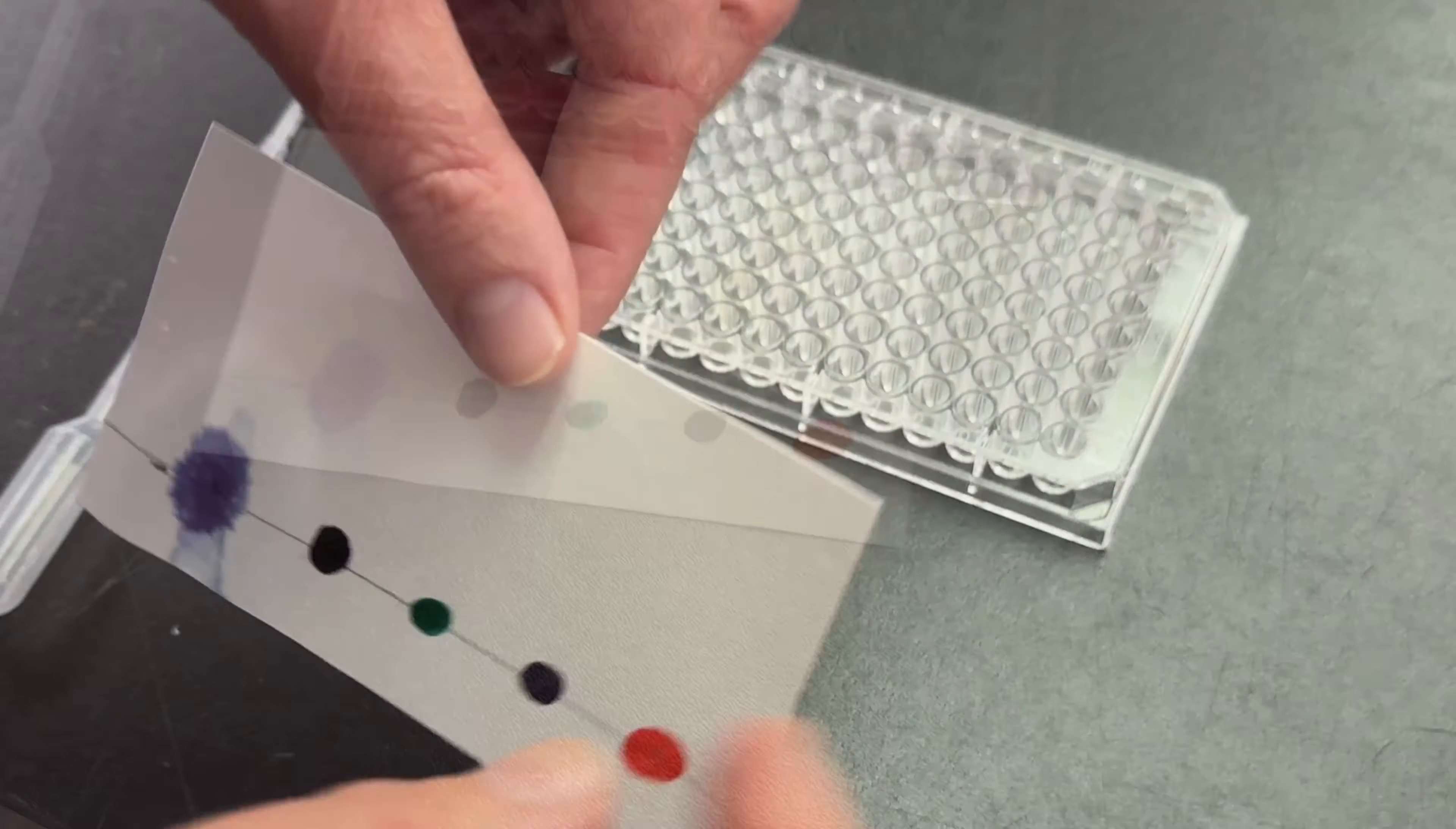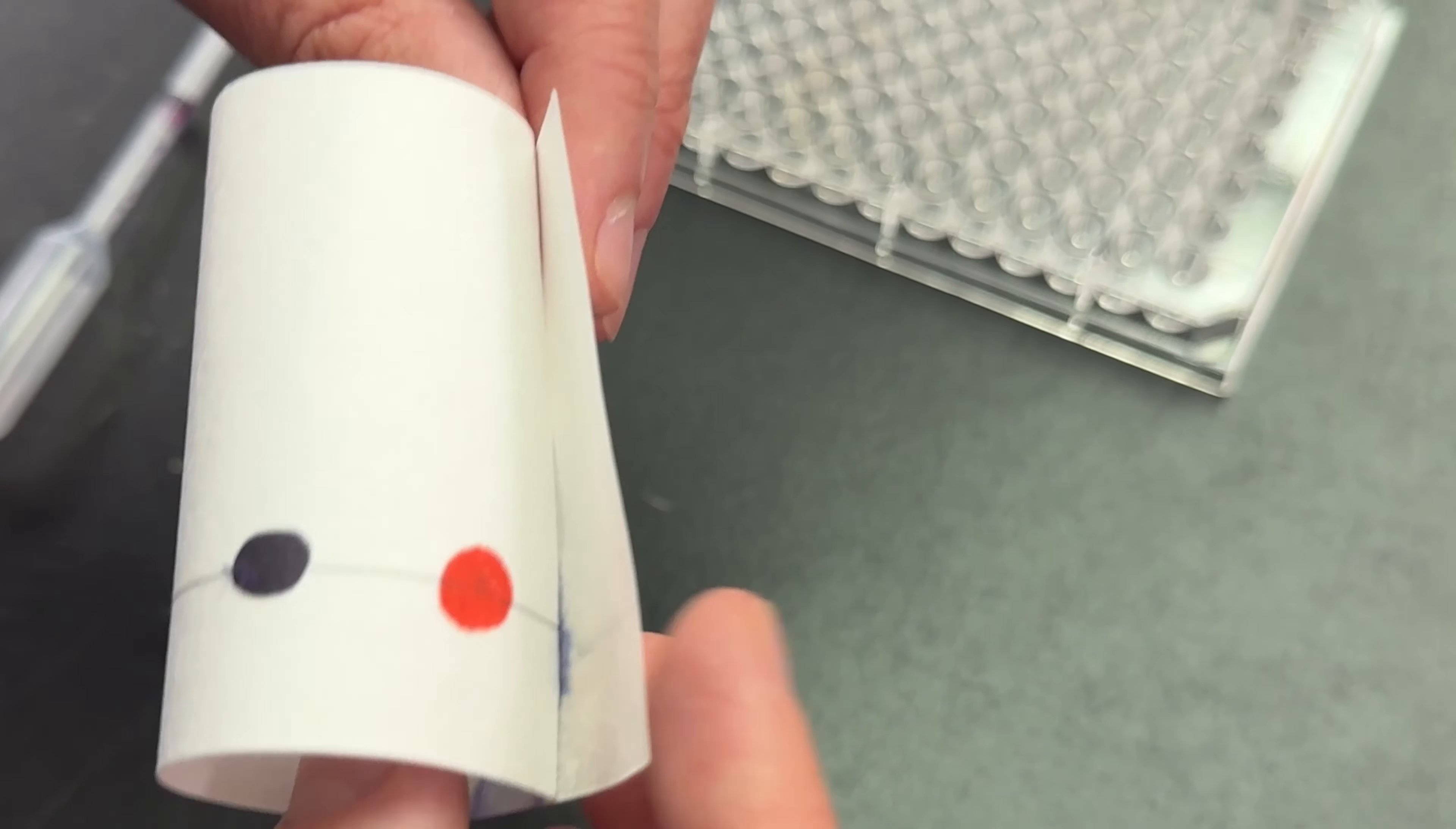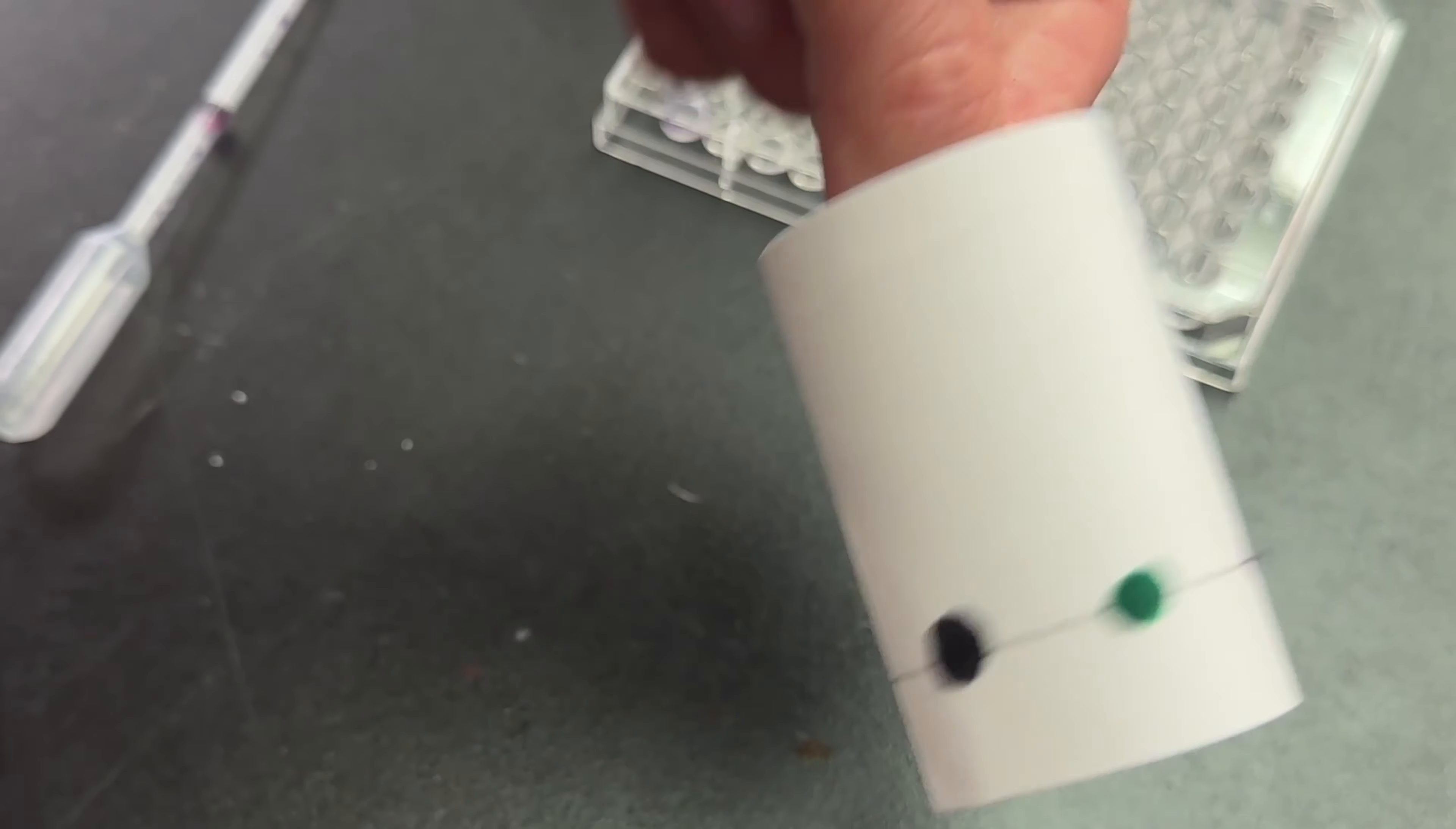Step five: when the paper is dry, roll it into a cylinder and fasten the edges together with staples or a small piece of tape.